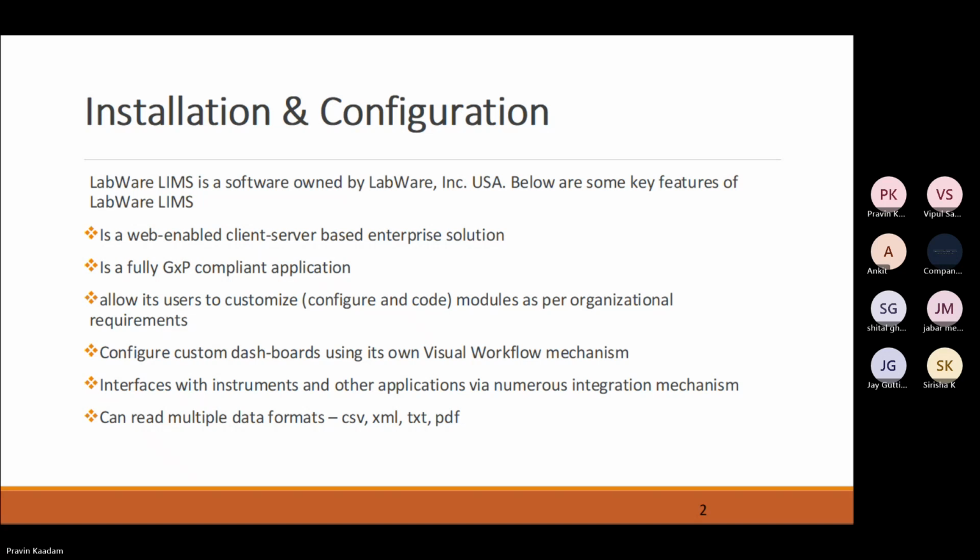Basically, Labware LIMS is afforded by only the bigger organizations. So when anybody asks you what this product is, it is an enterprise application. It is enterprise software, and it is a client server based application. When we say client server based, the application is usually installed on the server, and you need a client system, another PC, laptop, or desktop, in order to access the application.